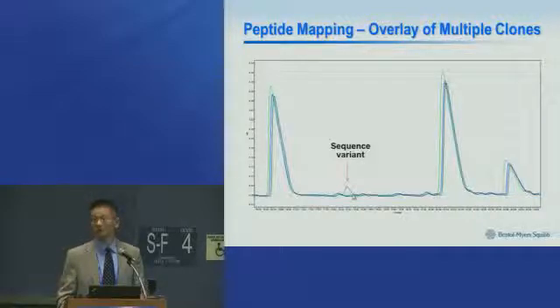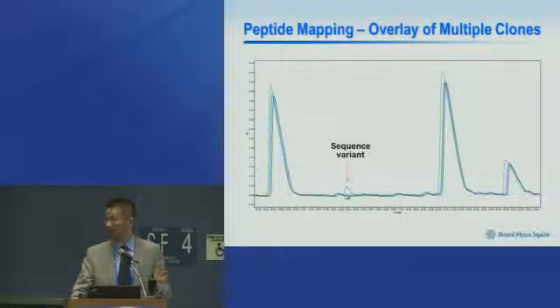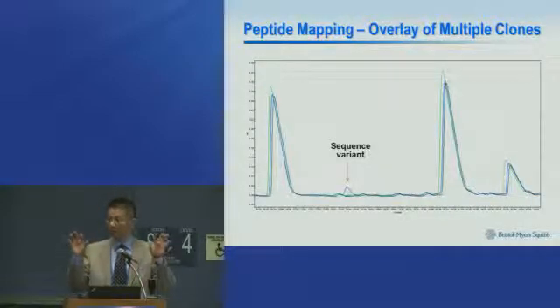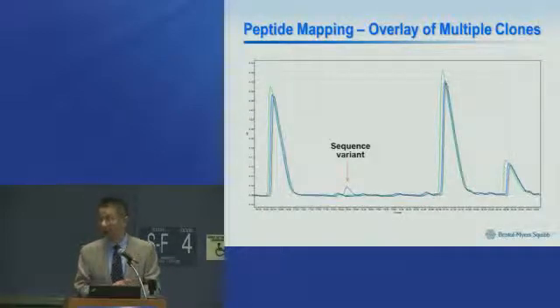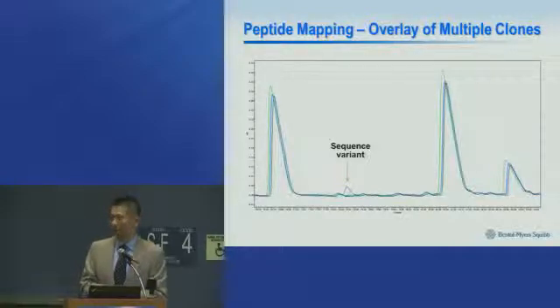That lets you easily focus on something that, in this case, is a real example of sequence variance. It's a few percentage, but we were able to pick it up quite easily by doing this. And that can significantly improve your efficiency, especially if you have multiple samples. Some of those are from independent clones, some are not. Just by combining these patterns, you can turn results much faster. On the other hand, if you have only one sample, it is much harder to do.